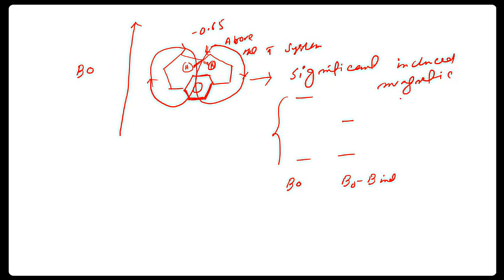Magnetic field which opposes the external magnetic field. So this is just their situations, positions. Their position makes them able to feel the lowest, exact or actual magnetic field. That's why this is a very interesting thing. VVI.